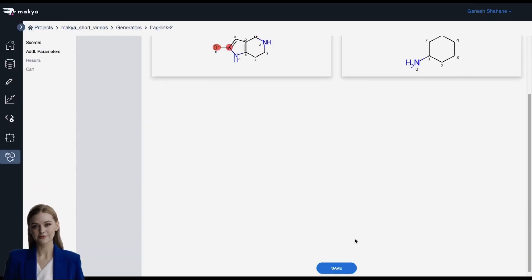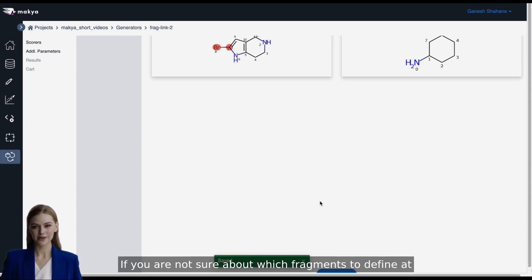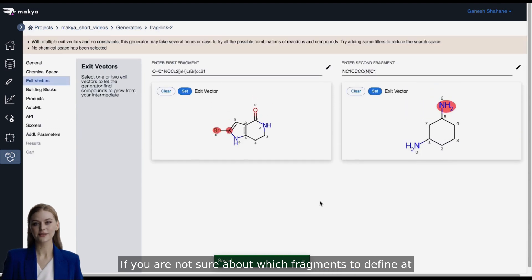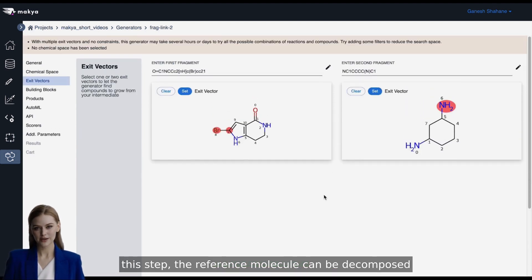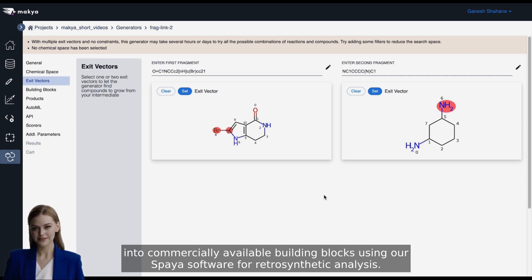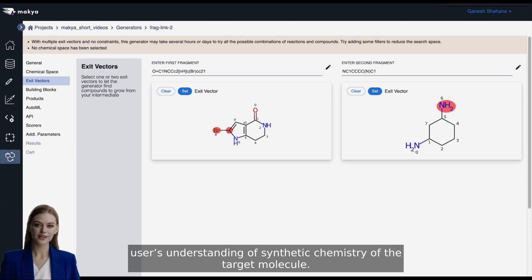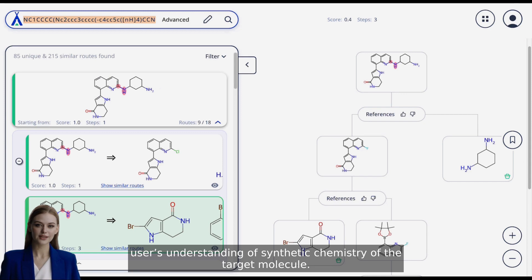Click Save. If you are not sure about which fragments to define at this step, the reference molecule can be decomposed into commercially available building blocks using our Spaya software for retrosynthetic analysis. Appropriate fragments can be selected based on the user's understanding of synthetic chemistry of the target molecule.